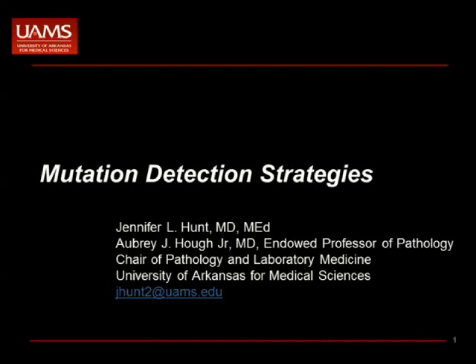So we're going to go back to some basics again. And I'm going to pick up on some things that Dr. Dietrich presented, especially in sequencing and FISH, and we'll go into some deeper detail on those technologies and techniques. I realize that many of you do these techniques in your laboratories, so you're quite comfortable with many of these and very familiar with them.